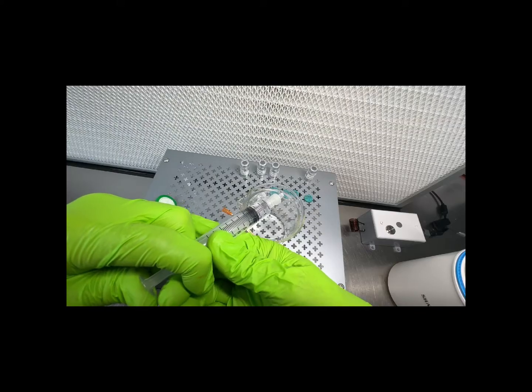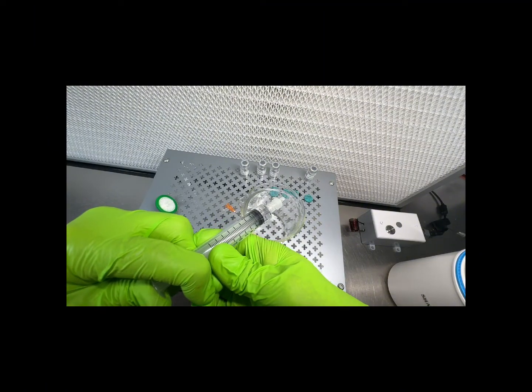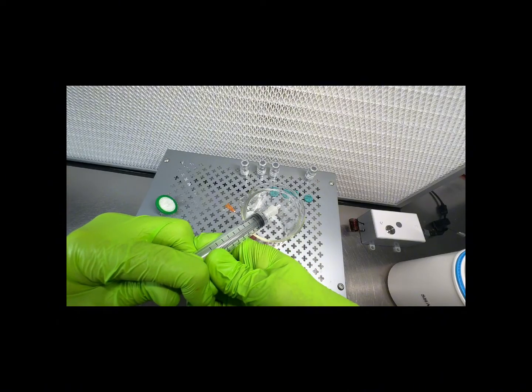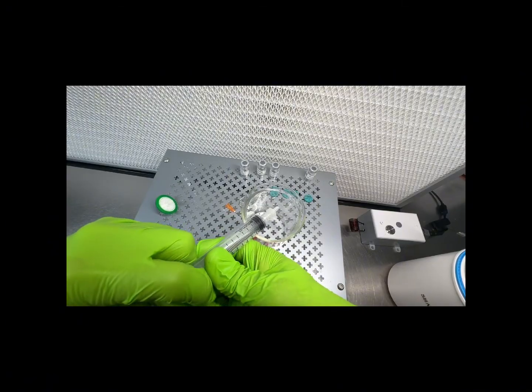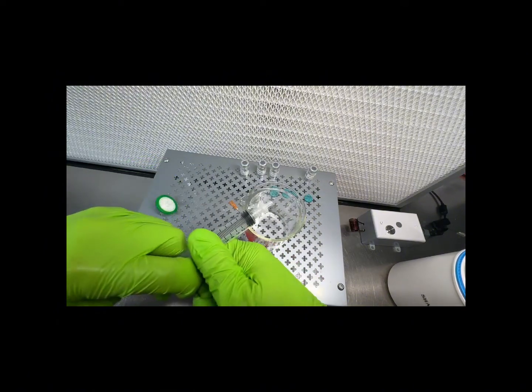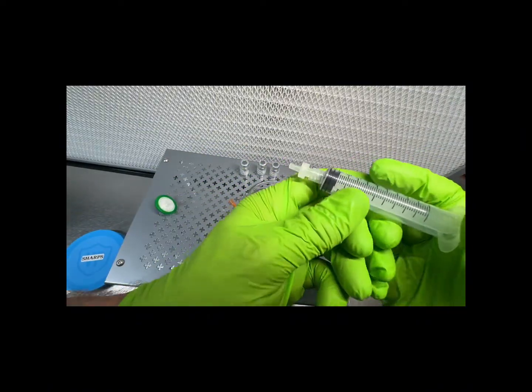Compared to some of the other stuff we've done so far, this is pretty easy. The cornstarch was the worst. It clogged it up pretty instantly. Okay, we're at 3 milliliters. It's not really even that much harder. I'm pretty sure we're going to pretty easily get 4 milliliters through this. So there we go. Yeah, that went through no problem. So that was 4 milliliters of tirzepatide pushed through with no problem.